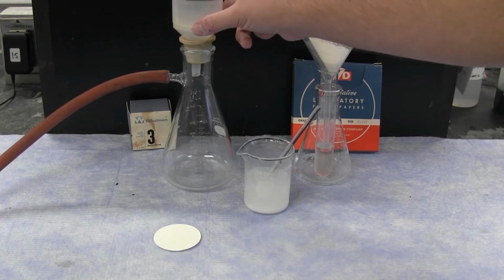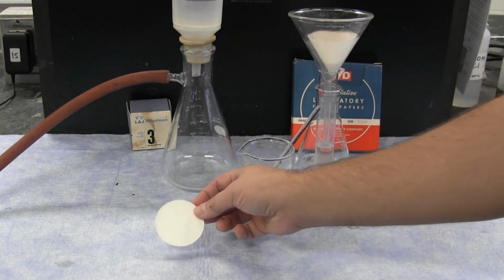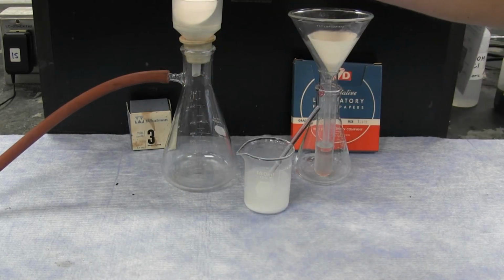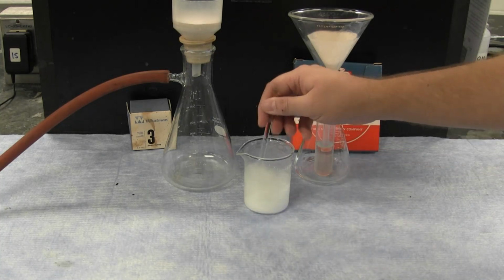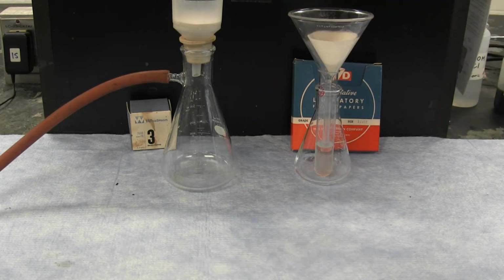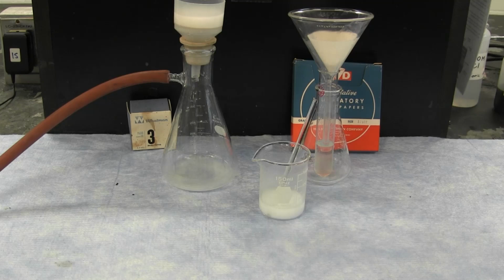It's placed onto a container that is connected to a vacuum system. The circle of filter paper can then be placed inside, the vacuum system turned on, and the solution poured through. Vacuum filtration is a much faster form of filtration.